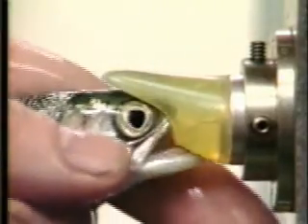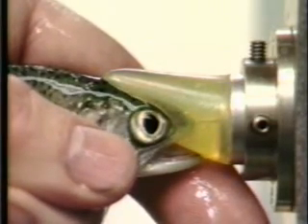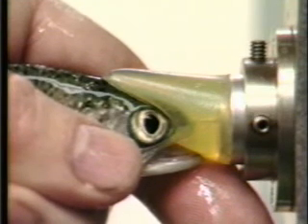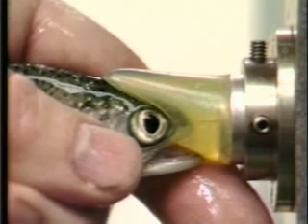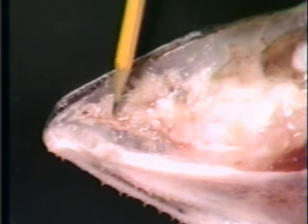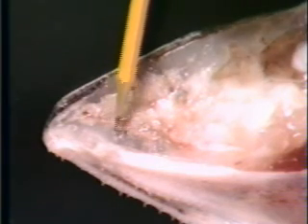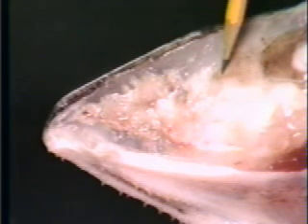Accurate coated wire tag placement is critical for achieving high retention, minimizing biological effects, and facilitating efficient tag recovery. In this photograph of a sectioned head of a sub-adult coho salmon, a properly placed tag is visible. The tag rests between cartilage on the midline in muscle, adipose, and fibrous tissue, well forward of the olfactory lobes of the brain.